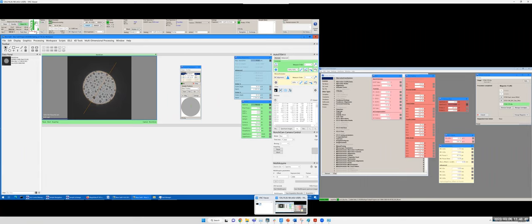You can see high order is done already. Okay, so that's good. I still want to click it once, okay? But don't click to zero. I want to focus on lower order now. So, okay, you can see all the higher orders are done. So we click lower order again, measure again.